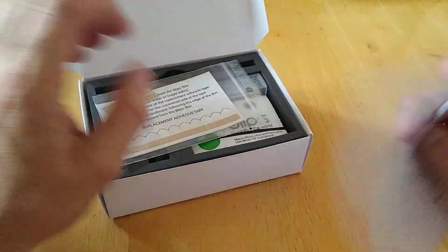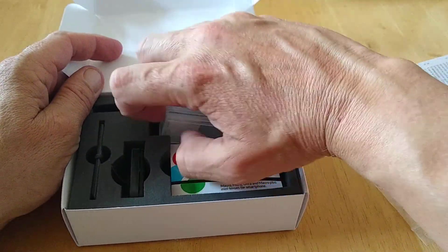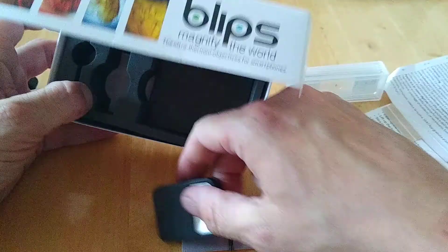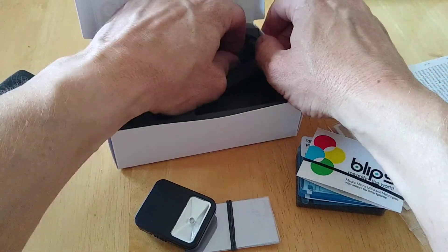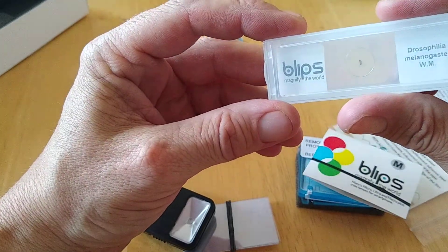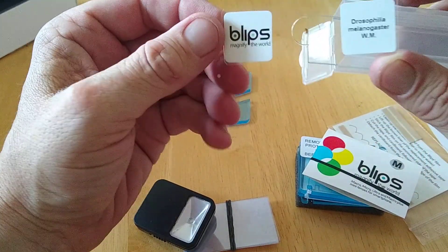We'll get some instructions here first on this leaflet, and then we get some replacing adhesive tape. Here is the full kit inside, so we'll remove all these pieces. You get a closer look at what's involved here — there's more in here. That's the full kit there, and here is what looks like slides, which come in a little pack. This is actually glass.